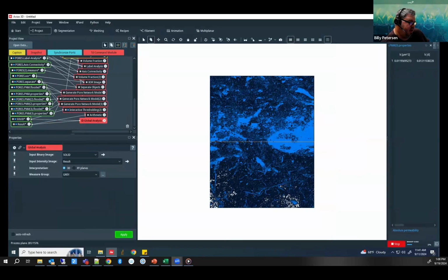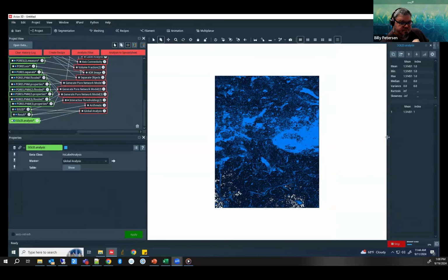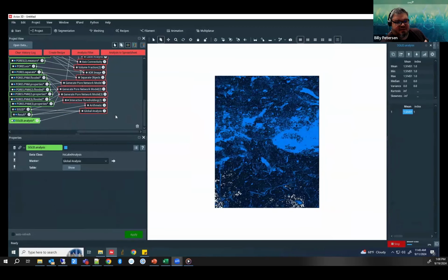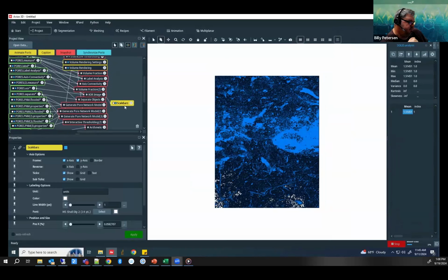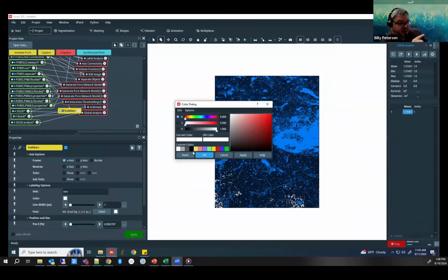Gray image, apply, solid analysis, got it right over there on the right side. That gives us the mean, and that's about standard. You get between like 1.3 to 2.3. And then for visualization, I have to apologize. I forgot to do the network area, or the network model, but I'll get to it at the end.